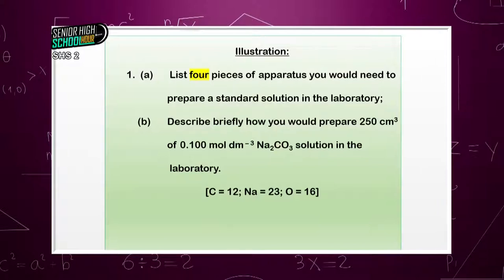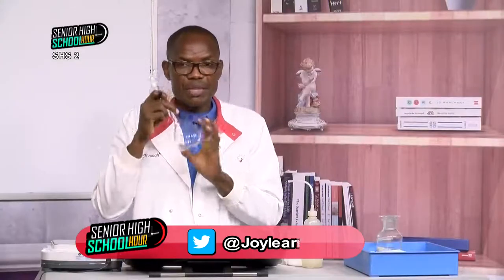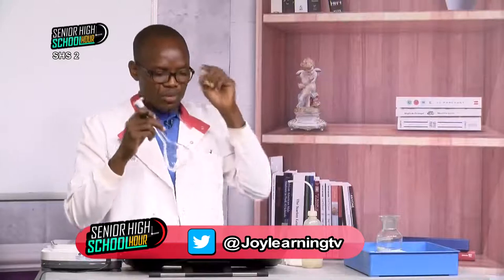B part of the question. Describe briefly how you would prepare 250 cm cubed of 0.100 mole per dm cubed sodium carbonate solution in the laboratory. So I need sodium carbonate, it's here. What is the volume? 250. Okay, so if it is 250, I go to the store, pick 250 cm cubed volumetric flask. If it is 500, you go and pick 500. If it is 1000 cm cubed, you go and pick 1000 cm cubed.